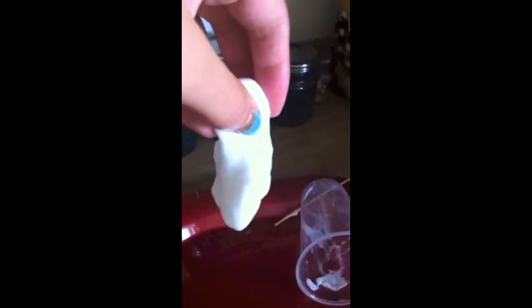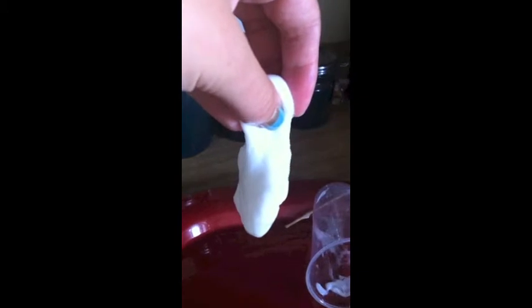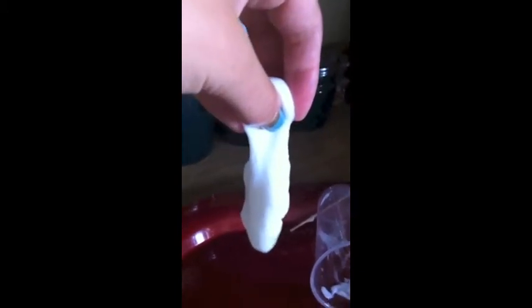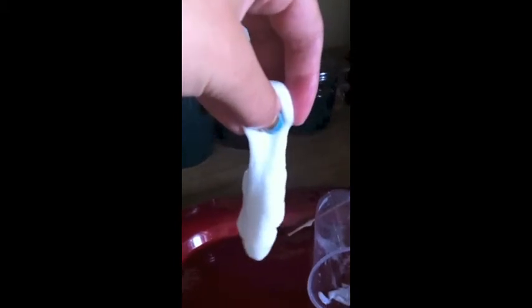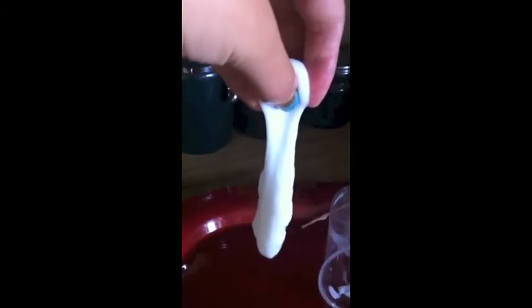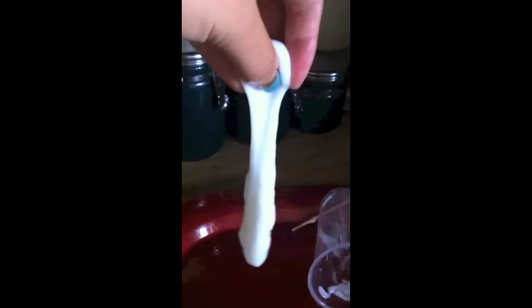So now I'm holding the GAC slime by one end, and as you can see, it's dripping down and forming a longer GAC string of sorts. And this looks like it has a liquid shape because it has a definite volume but an indefinite shape. So that's the GAC slime.